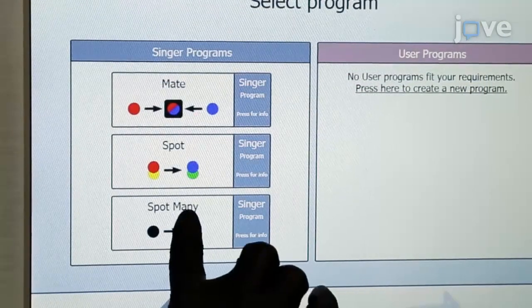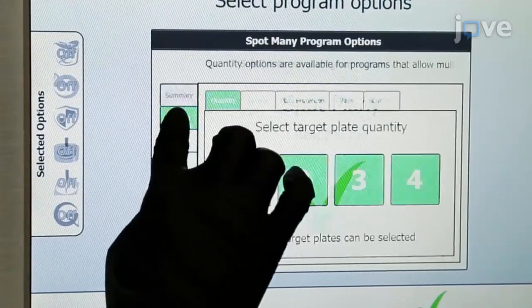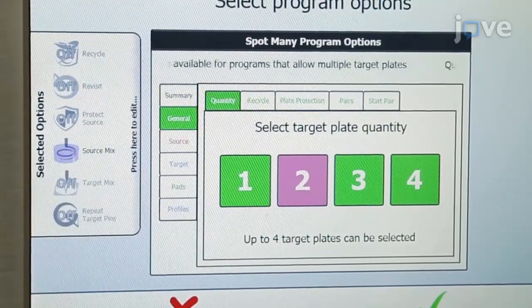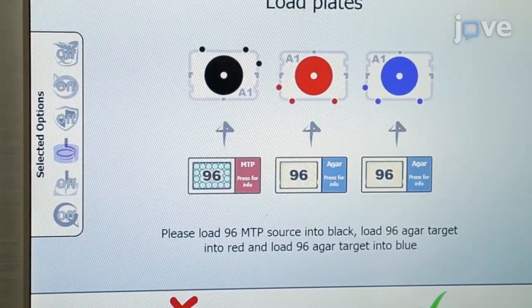Select the Spot Many program to make two copies per 96-well plate. Do not use the Recycle or Revisit options to avoid back-contamination of the frozen stocks. Also, select the option to swirl up and down in the source to mix the yeast.